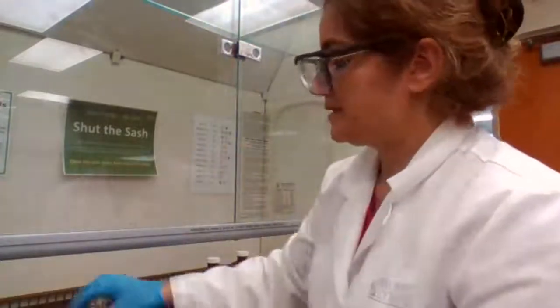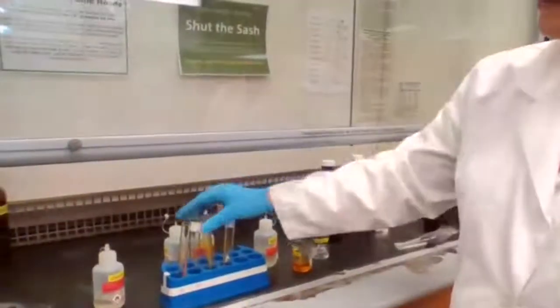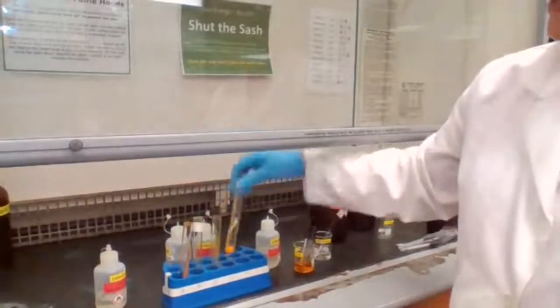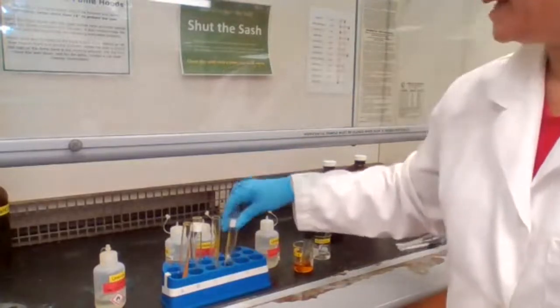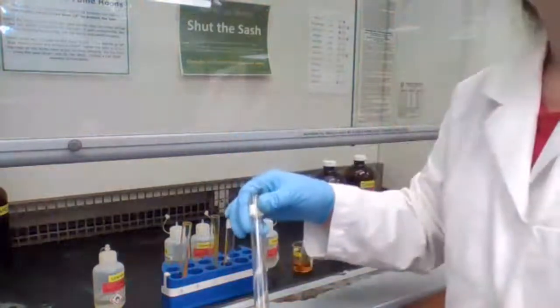So it would be positive for A, positive for C, and positive for D. B would be negative. It was just a little contamination that I had there.